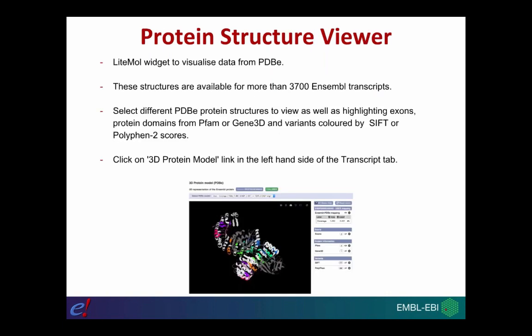The final thing I want to talk about is the protein structure viewer. This is a new feature that we've been working on, coming from our colleagues at PDBe. We've included a LiteMol widget to visualize protein structure data for transcripts you might be interested in studying. At the moment we have structures available for more than 3,700 different Ensembl transcripts. You can select different PDBe protein structures to view, manipulate the view, show protein domains from PFAM or Gene3D, and view variants colored by SIFT and PolyPhen scores. You access it by clicking on the 3D protein model link in the left-hand menu of the transcript tab.